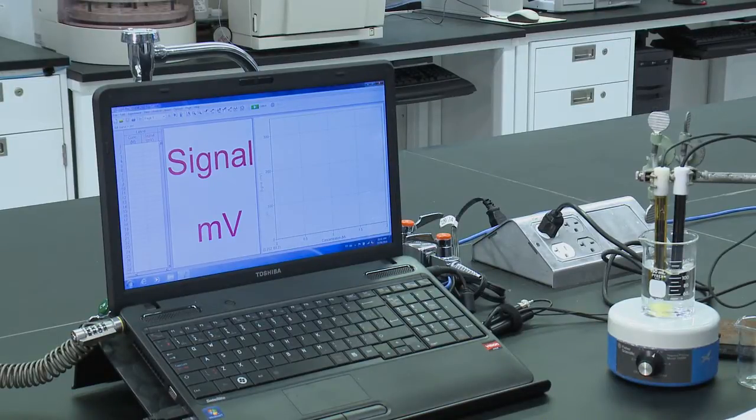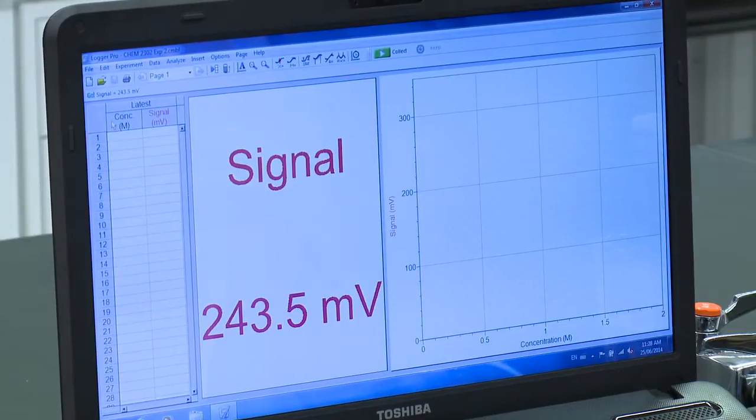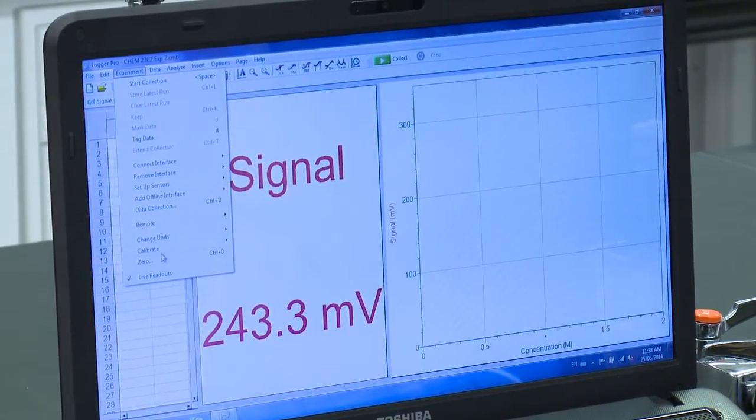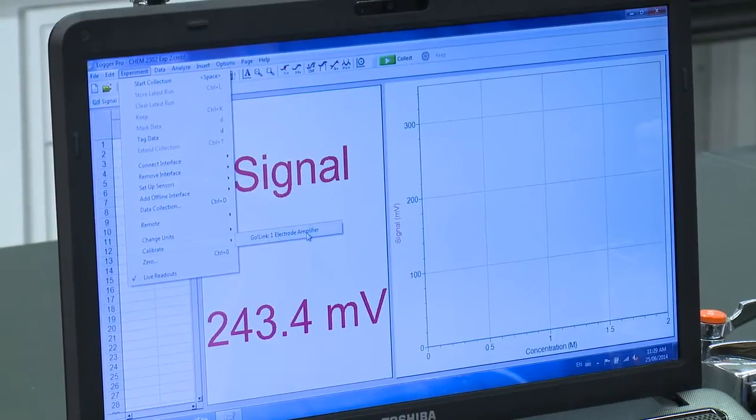Now that the correct file has been open, we want to go to Experiment, Calibrate, and click on the electrode amplifier.